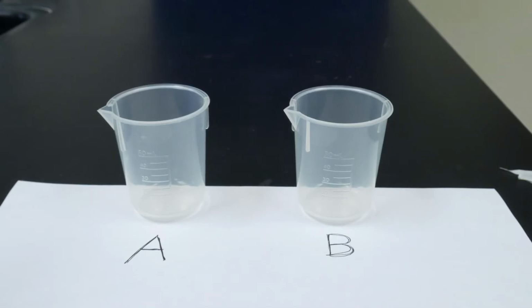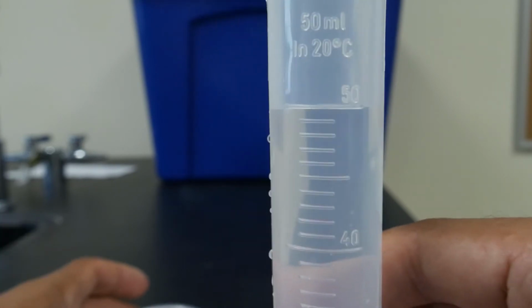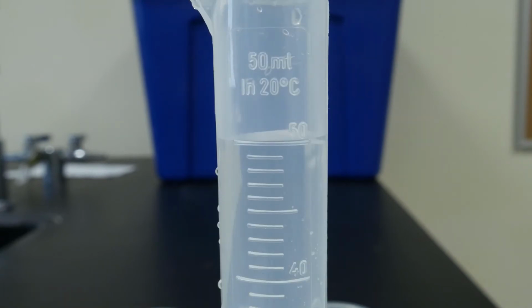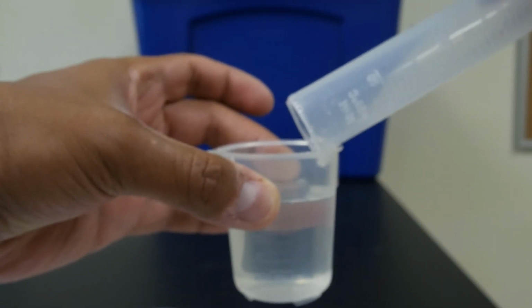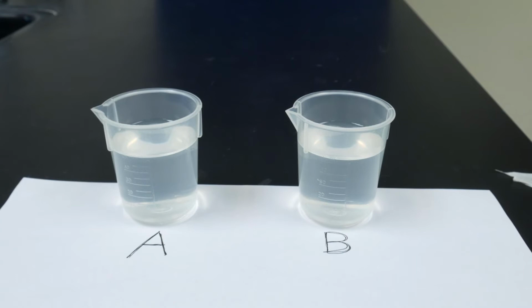All right, guys, this is going to be part B of the lab. So right now we have two beakers. We've labeled 1A and 1B, and we're going to put 50 milliliters of water in each one. So here is 50 milliliters of water for beaker A. Let's pour this in. And here is 50 milliliters of water for beaker B. So let's pour this one in as well. So we have both beaker A and B now with 50 milliliters of water in each.